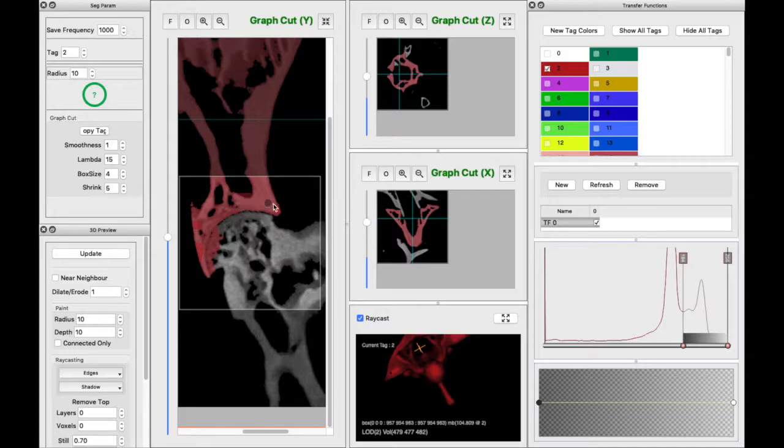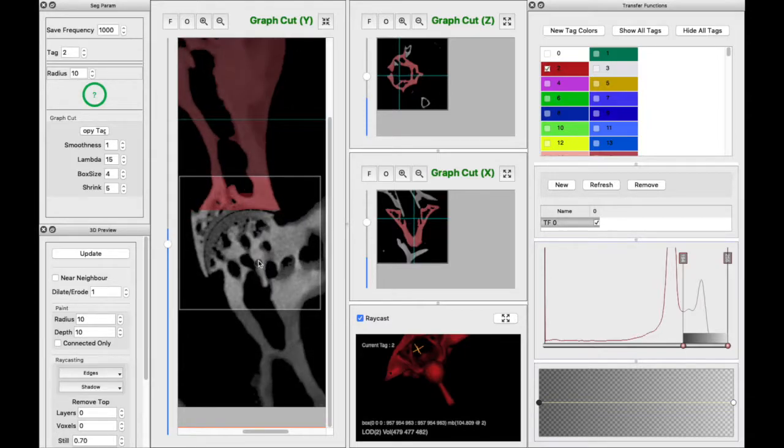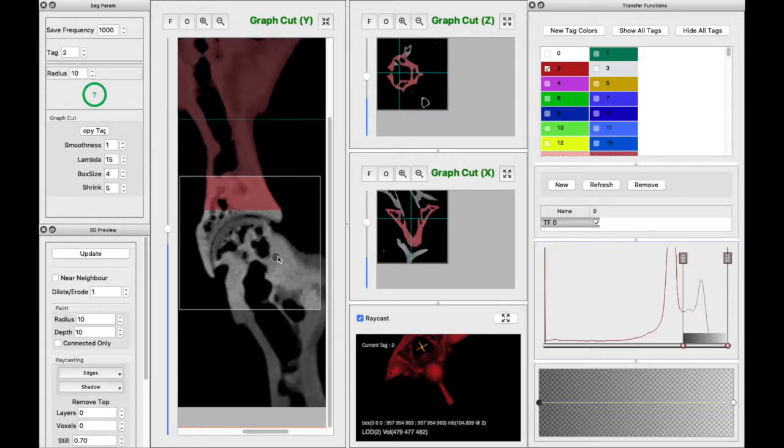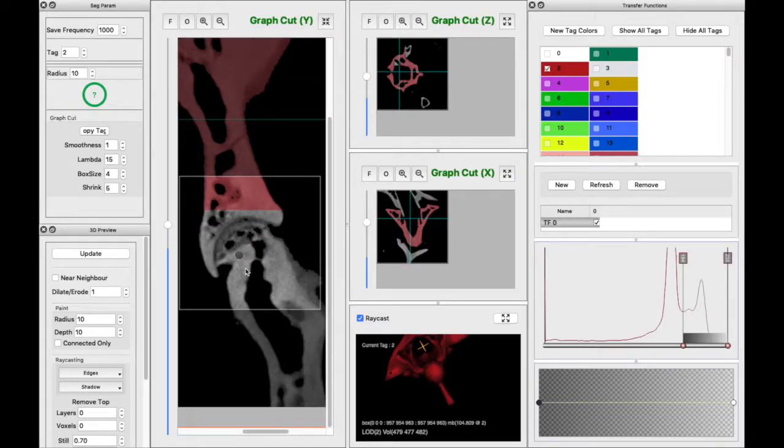See how it followed the line fine until we added this little chunk over there. And then once you try to go to the very tip of this, it colors in all that. So we could do a shift 255, but see, it's really resistant and it'll change every single slice. It's a real pain to have to do. That's because the paint wants to stick together and group things, just like how we did it on the other condyle. It was really easy to go in and do this region, right?